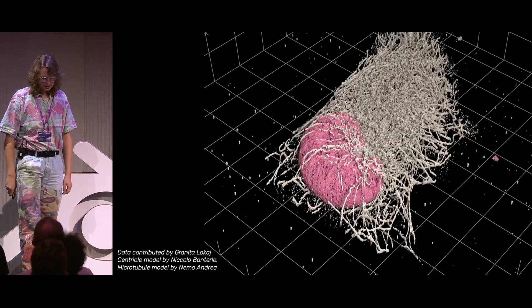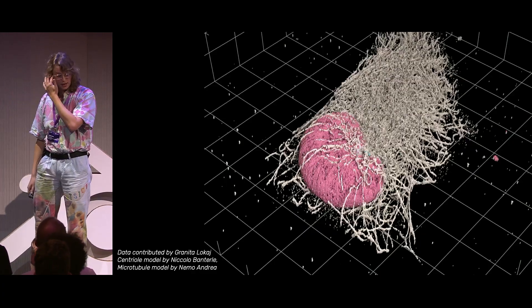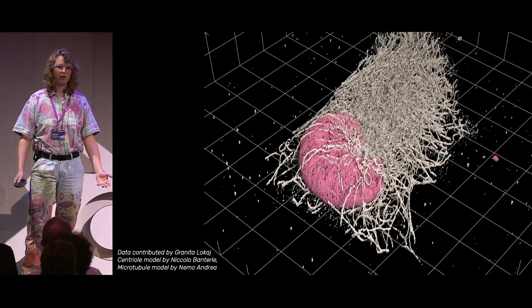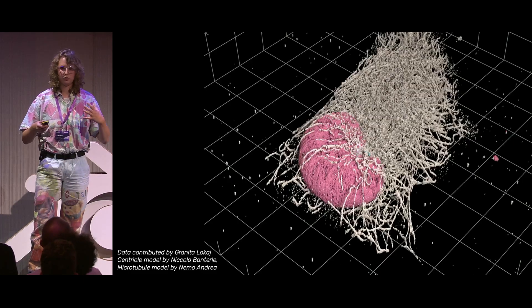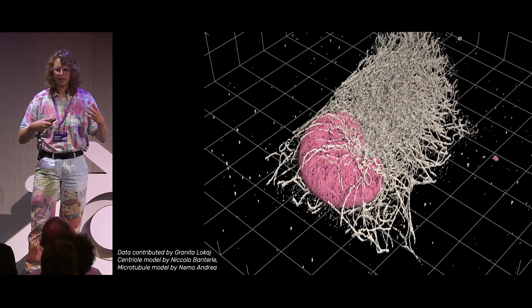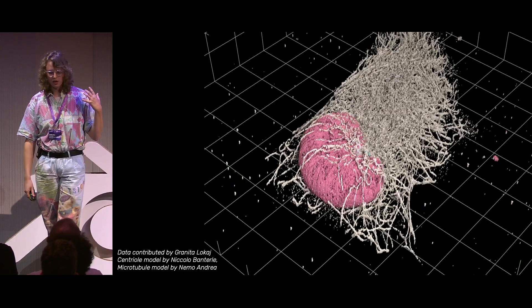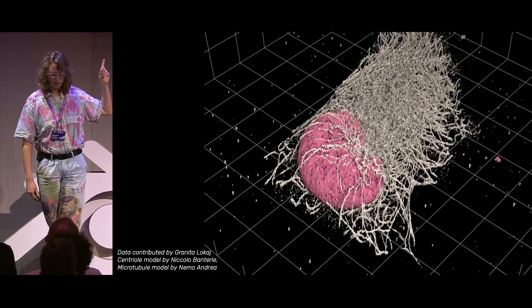And then, the last data set I'm showing is this human cell, this is actually the same one that was in the example. Here in pink we have the nucleus, and in white we have the skeleton of the cell. So this is also the traffic network, and this is really relevant in cancer and in understanding how cells go wild and how they move.